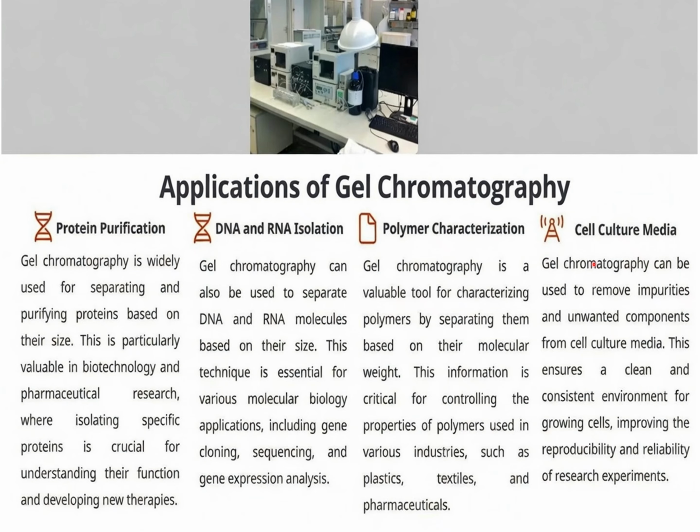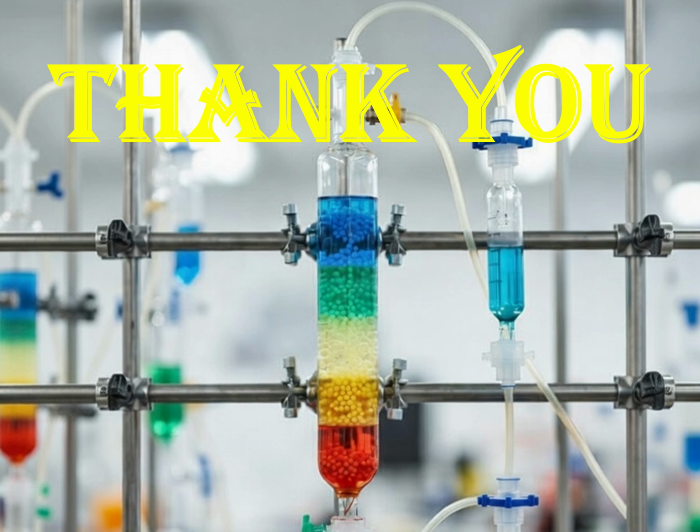The last one is cell culture media, like agarose. These are the different cell culture media, and for quantification or analysis of them we use gel filtration chromatography. So these are all about gel filtration chromatography.